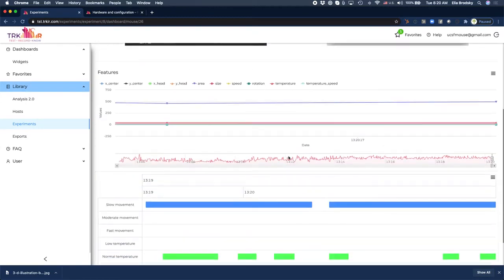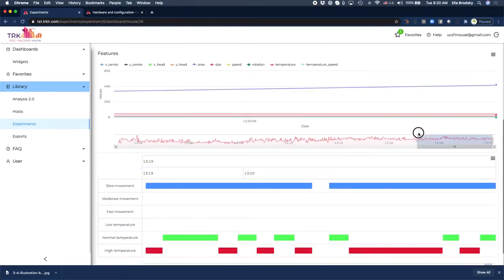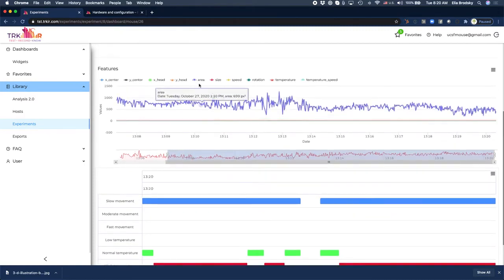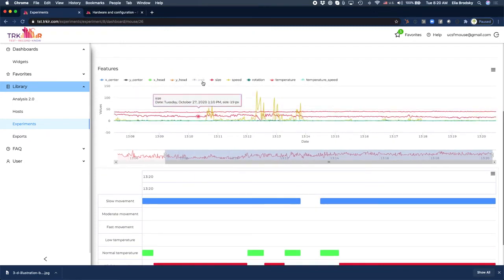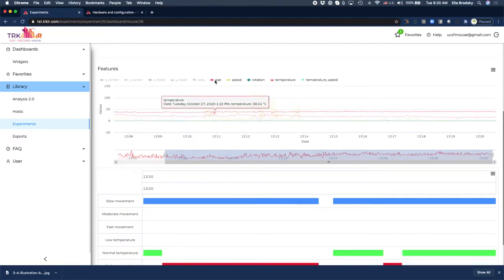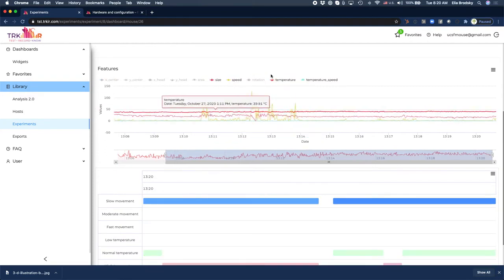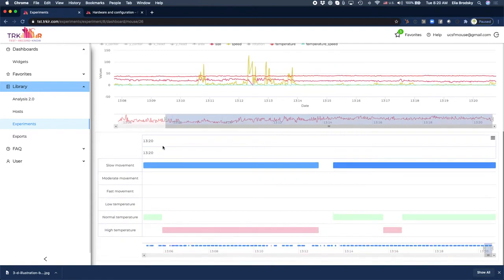And if you scroll down, you will start seeing the data. So if you enlarge this, you can see the area changes, and we can remove that. Now you can see the speed. Let's remove some of these. Okay, so here you have speed, size, and temperature, right? So you have these spikes in temperature, for example, which is interesting.